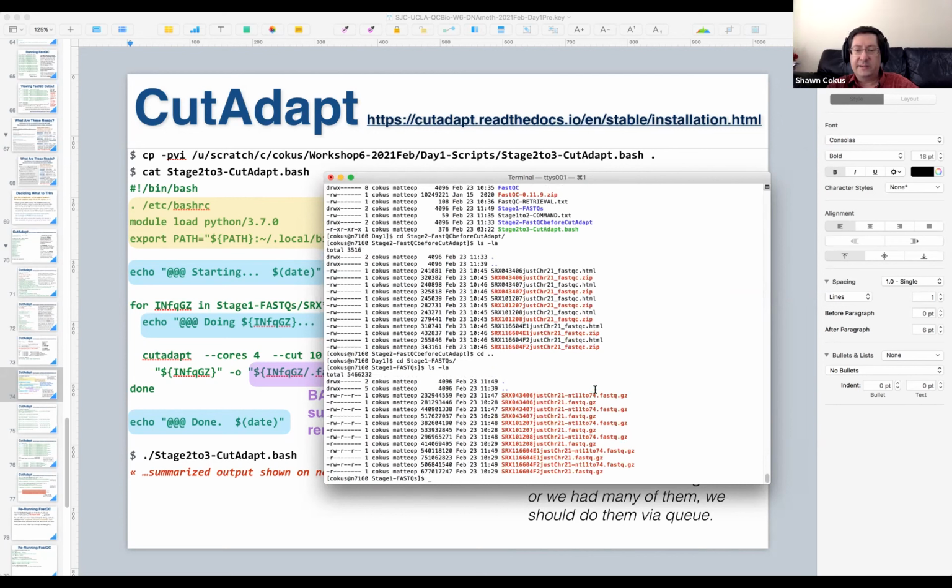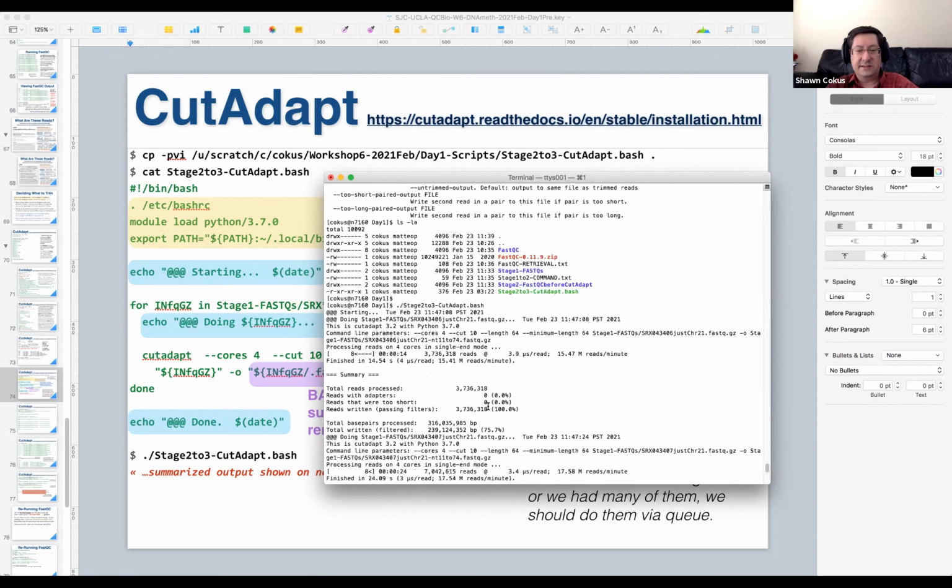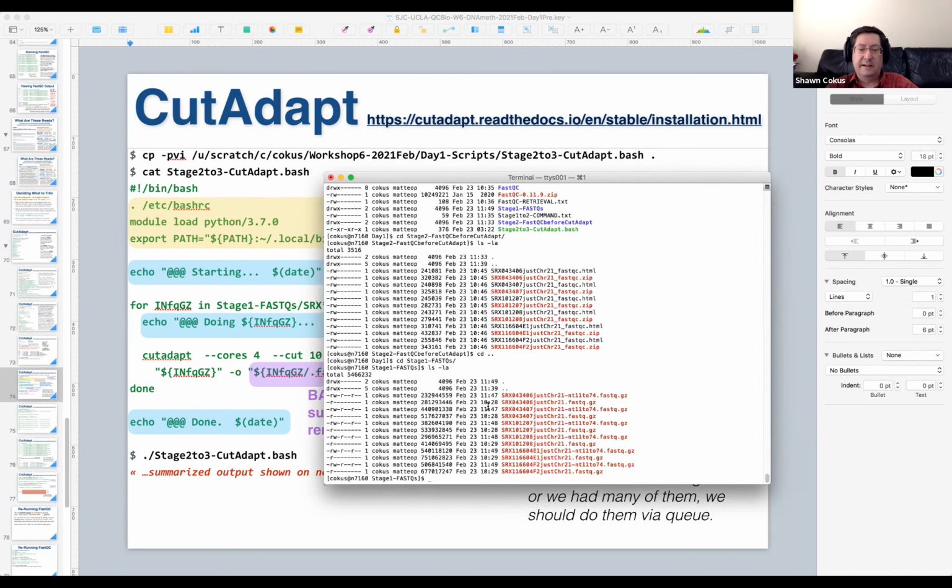We've got these new NT11 to 74 guys, and that's looking pretty good. I didn't see any error messages in the text here. The files, none of them have 0 size. Another reason to use ls -l all the time is that things like empty files are going to be very obvious, having 0 as the size of the thing. These look reasonable, we could actually start to peek into these to see if this thing actually did what it was supposed to do. All right, so let's do that.